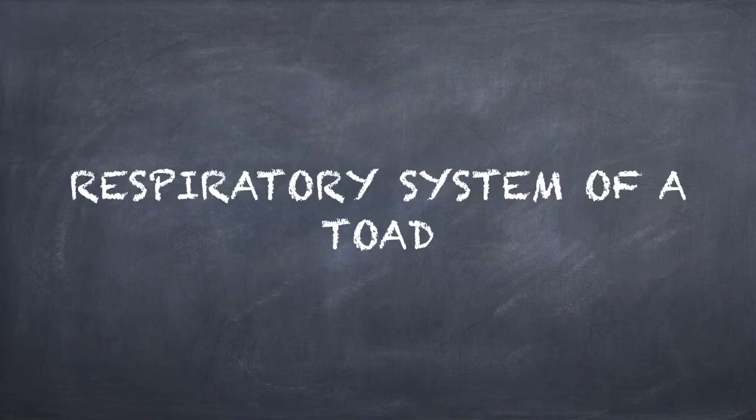Respiratory system of a toad. Toads allow the exchange of gases with the external environment through respiratory surfaces, such as the skin and lungs. The thin membranous skin of the toad enables the diffusion of gases between its blood vessels and the surroundings. This is called cutaneous respiration. They are also capable of pulmonary respiration, which allows the exchange of gases in and out of the lungs.